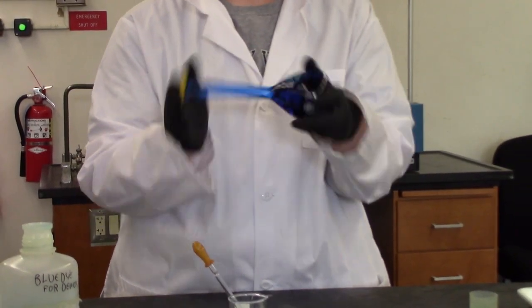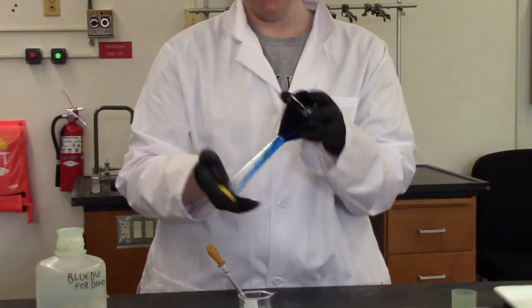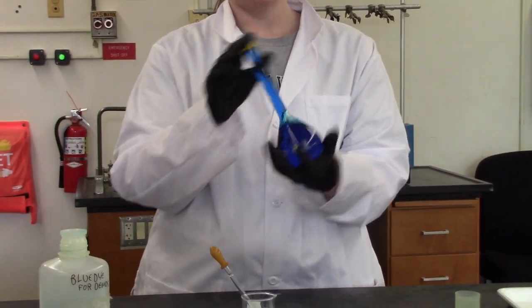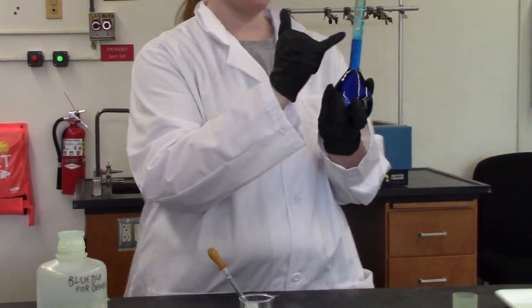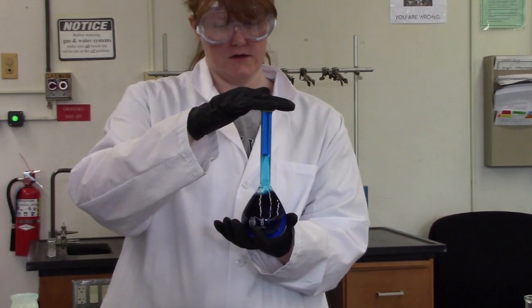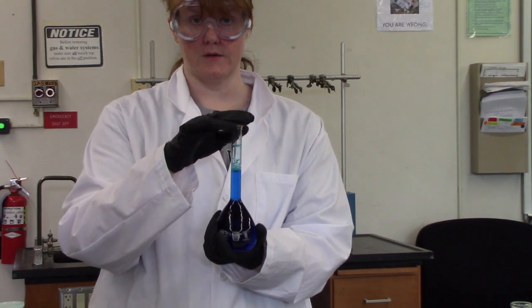Now, you're going to be diluting your already dissolved oxalic acid. So you have to invert it like this 10 to 20 times to ensure that you have a homogeneous solution. It's not going to mix very well, especially in this region, because of the simple fact that it's very narrow. So to help it mix completely, you want to make sure to invert thoroughly.